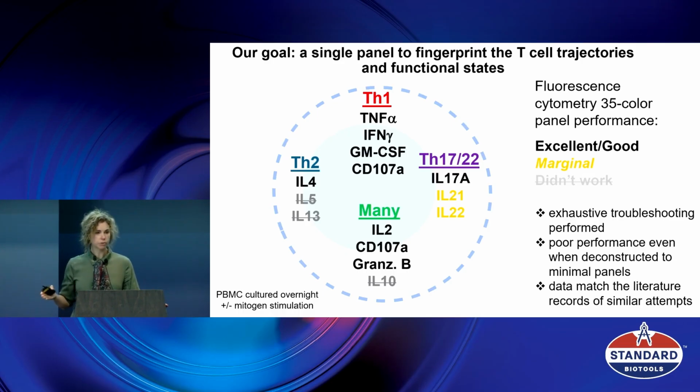If I go back to the literature, I can see that some cytokines, and they're spoken through in this slide, right? They're not really measured well in the data that is produced by other labs. And I want you to look at this and think, when you see the paper that talks about cytokines measured from the cells, which ones do you usually see? It would be the ones in bold here, okay? It will never be IL-5 or IL-13, okay?